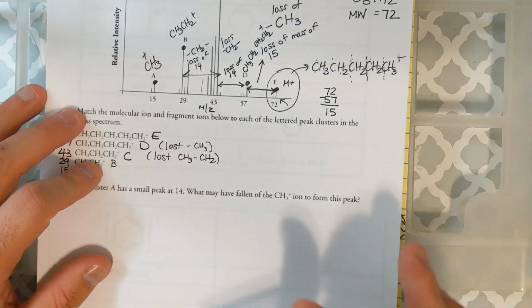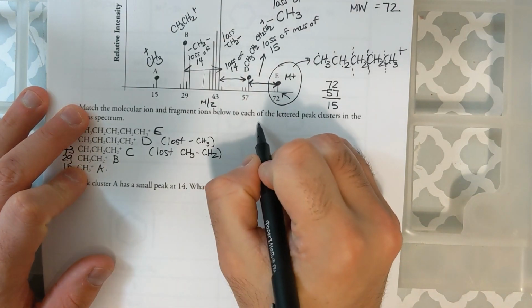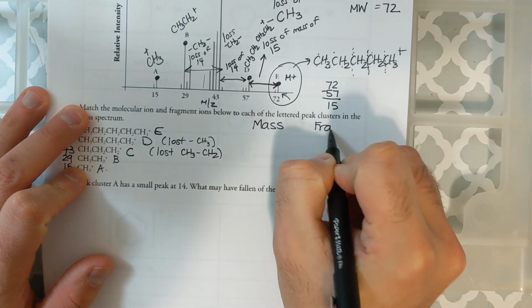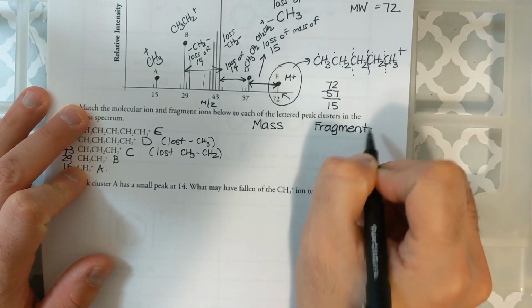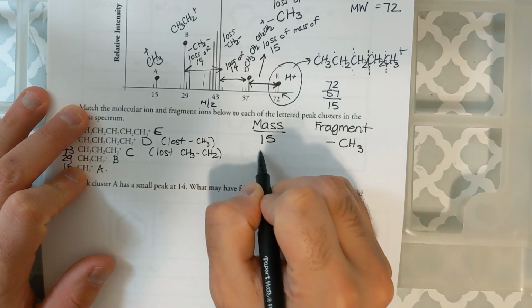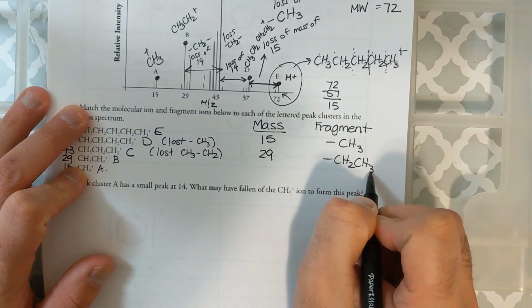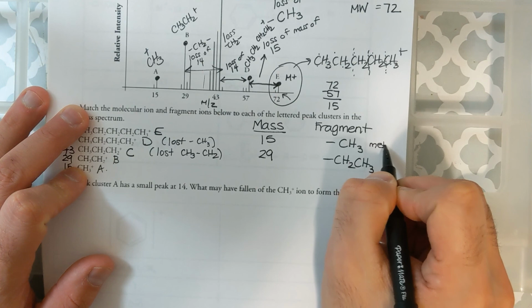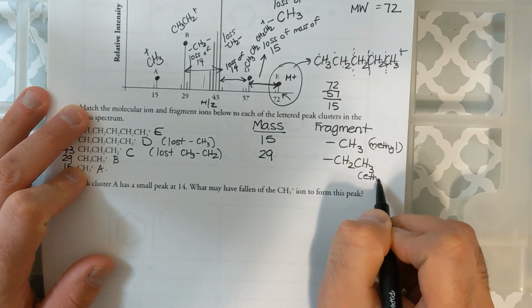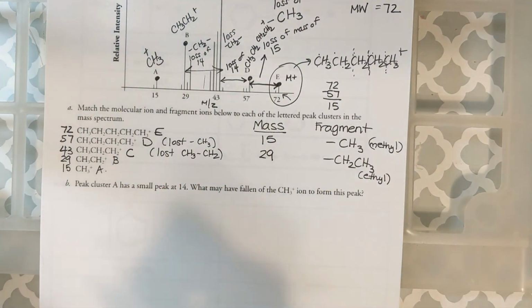Some important masses to consider, and you're going to have to know for mass spectrometry, mass and fragment, and you're going to see this on the next page. If I have a mass of 15, that is definitely CH3. If I have a mass of 29, that's going to be CH2CH3. Don't forget that CH3 is methyl and CH2CH3 is ethyl. This is going to come up a lot in the work that we're doing.